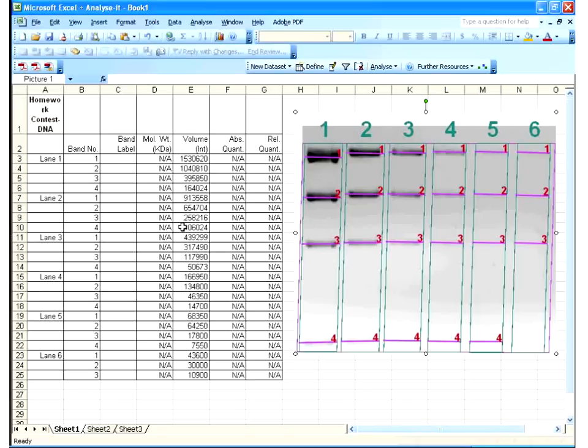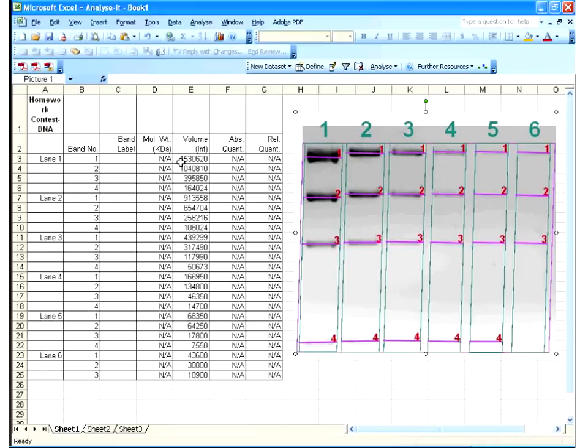So, I have my gel with lane numbers and band numbers beside the quantitative data here. All ready to go. So, I have lane one, band one, lane one, band one. There's the density. Lane two, band two, and so on and so forth. So, lane two, band one, and so on. So, I have the density data right beside the gel image data.